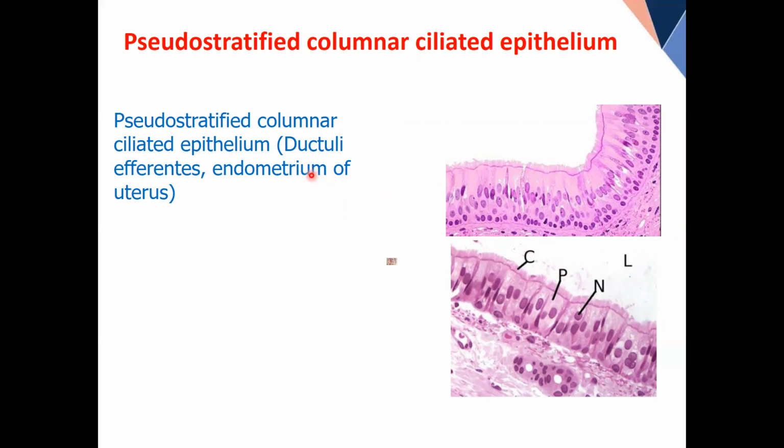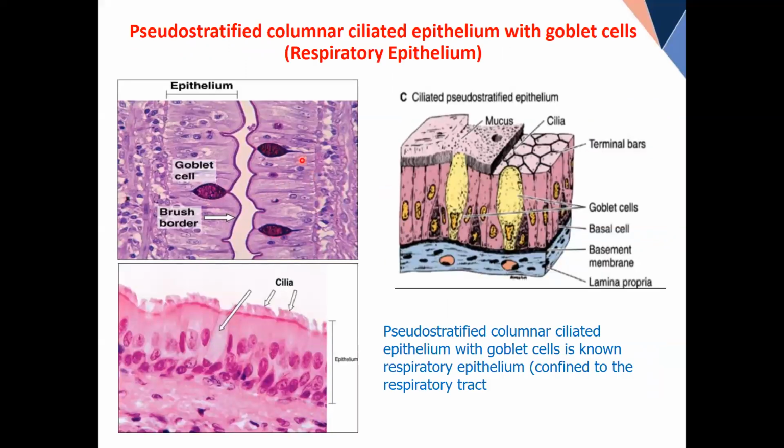Some sites are mentioned here. Third type, look at this, beautiful. Either this one or this one. This is the one which is called the respiratory epithelium.